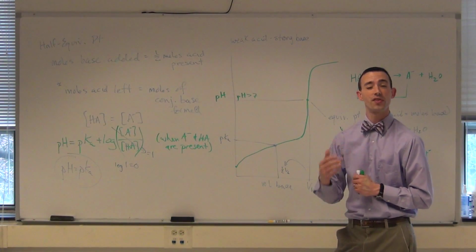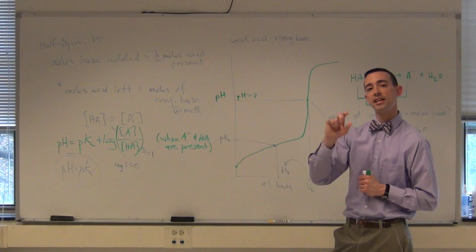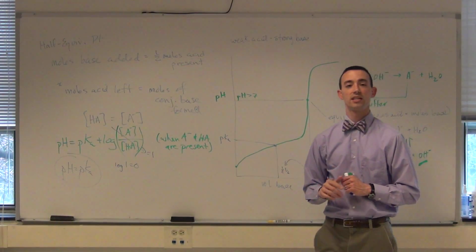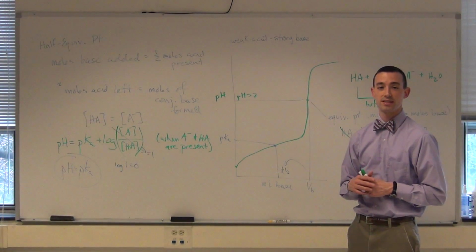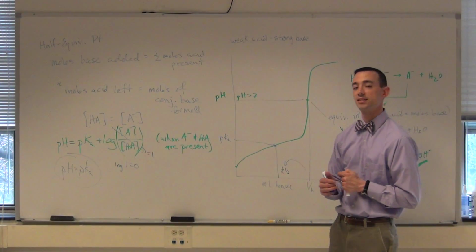You'll use phenolphthalein as your indicator. So you're looking for that clear to light pink color change to tell you when you've reached the equivalence point. You want to conduct 3 titrations that are consistent and giving you the same concentration of your base. Because you really want to know, as accurately as possible, that concentration of the base.